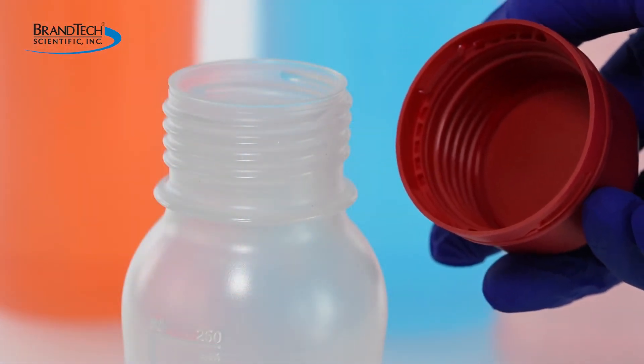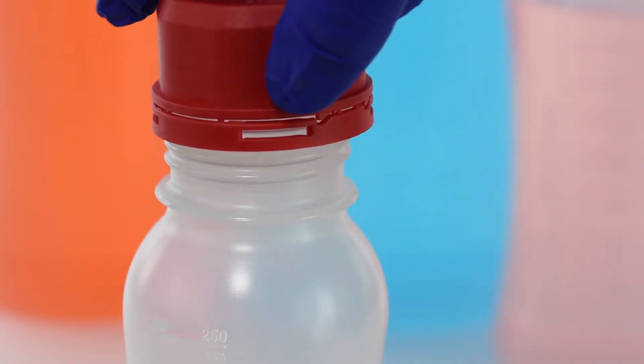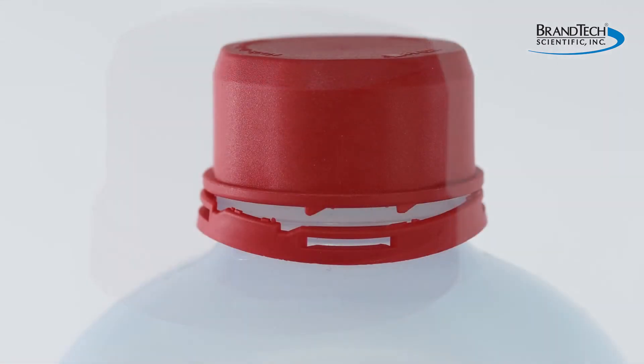The VitGrip bottle threads and screw caps are precisely matched to form reliable leak-proof seals without the need for seal or cap liners that can wear, corrode and cause contamination. The cap is also tamper evident to ensure its sample integrity.